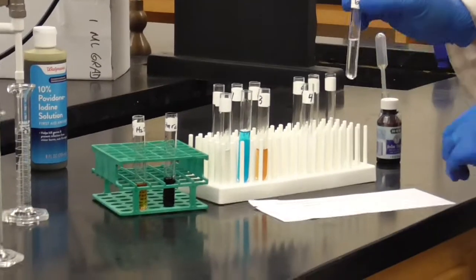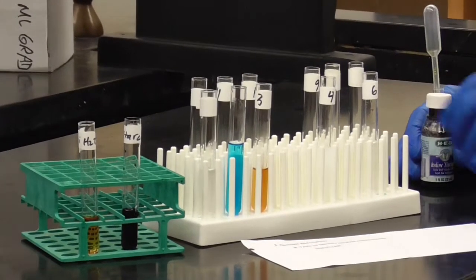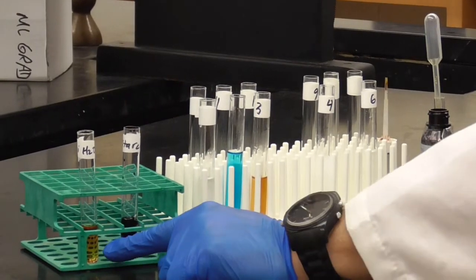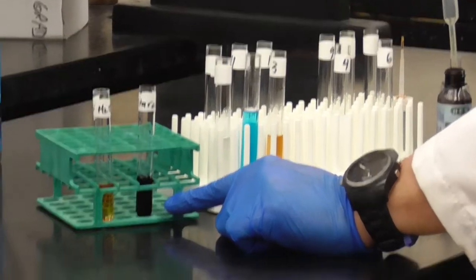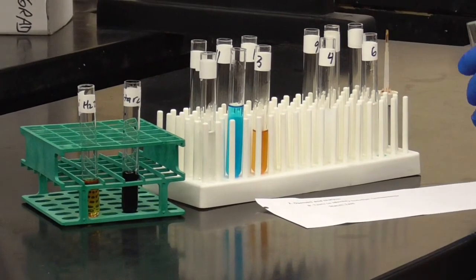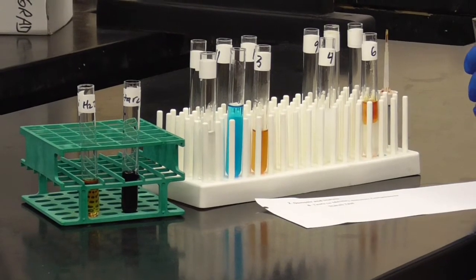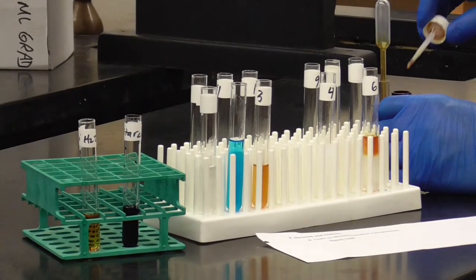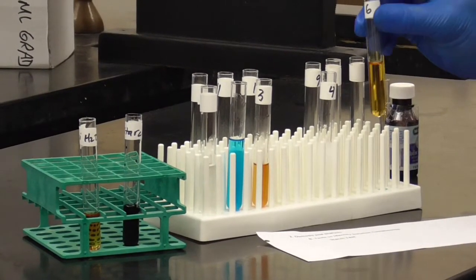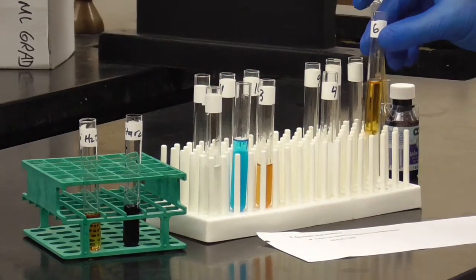And that's with this test tube here. We'll add a couple drops of the iodine. And remember, the negative is just that color, the positive is the dark purple color. All right, so a couple drops of iodine. 1, 2, 3. Looks like that so far. Give it a quick mix. And so looks negative for starch.